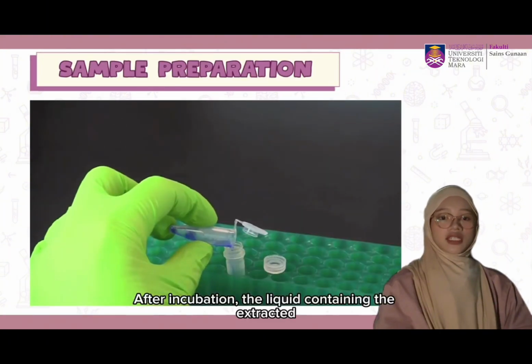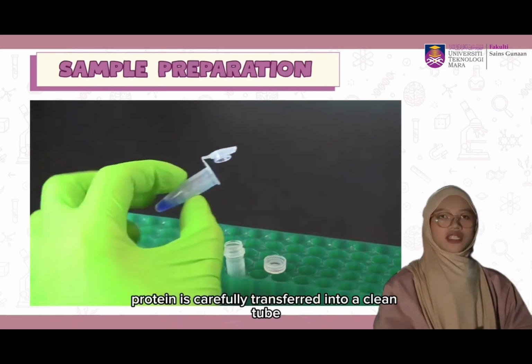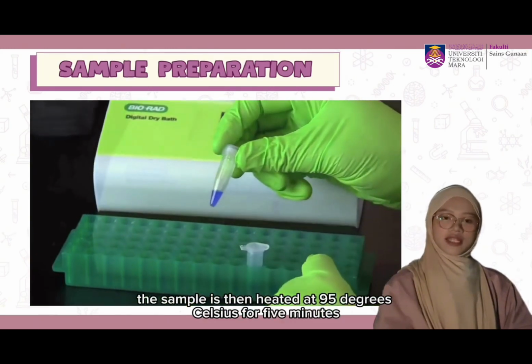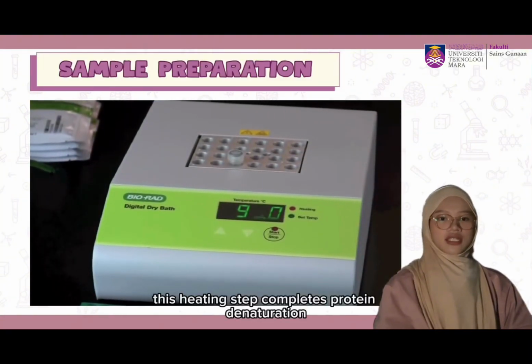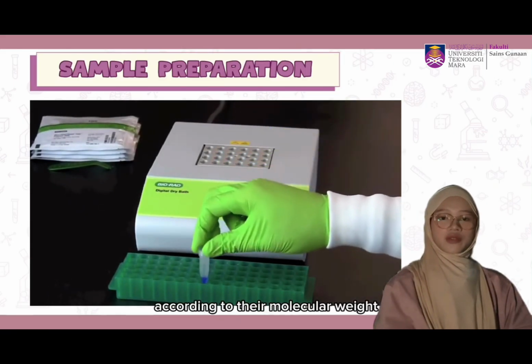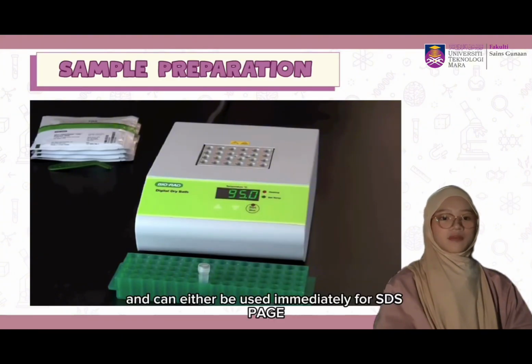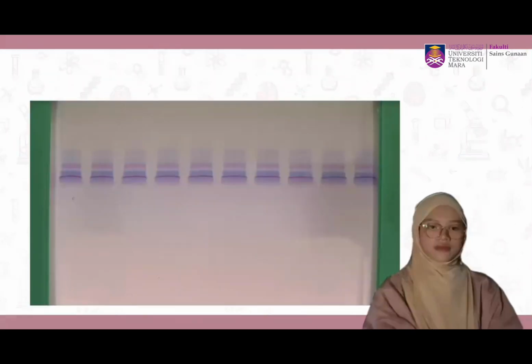After incubation, the liquid containing the extracted protein is carefully transferred into a clean tube while avoiding any solid tissue fragments. The sample is then heated at 95 degrees Celsius for 5 minutes. This heating step completes protein denaturation, ensuring that proteins are separated according to their molecular weight during electrophoresis. At this stage, the protein sample is fully prepared and can either be used immediately for SDS-PAGE or stored at -20 degrees Celsius for further analysis.